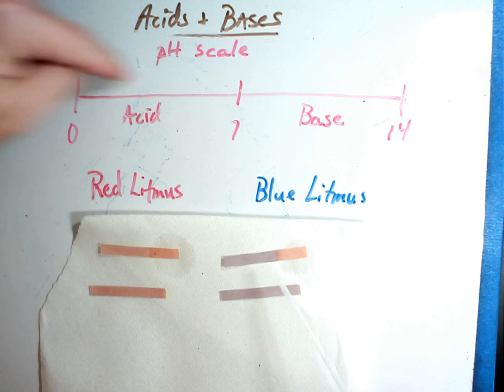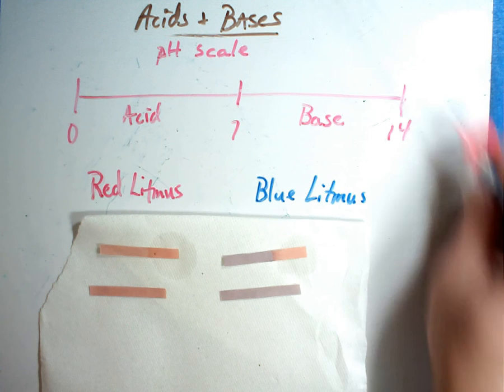Does it tell me where on the scale it is? No. It just tells me an acid. It's an acid. So for example, if I read a question on a test that said you walked into the lab and the labels fell off on the floor, which one is which, you could literally put it on litmus paper and you'll know which one's the acid or which is the base. Let me show you what a base does.